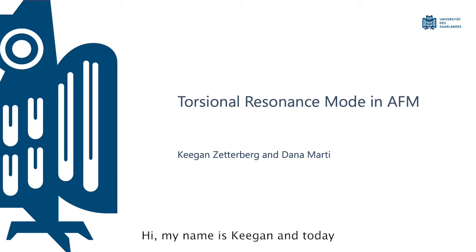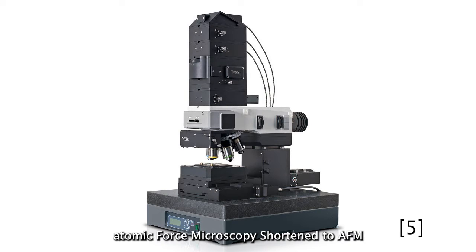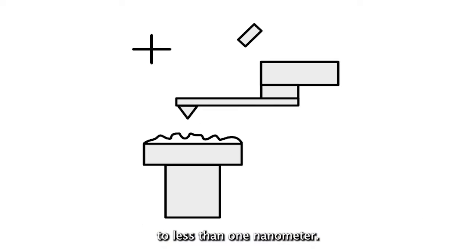Hi, my name is Keegan, and today I will be telling you all about the wonders of torsional resonance mode for atomic force microscopy. Atomic force microscopy, shortened to AFM, is a very high-resolution type of scanning probe microscopy with demonstrated resolution of up to less than 1 nanometer.